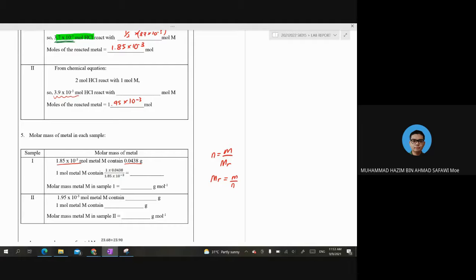23.6756, so 23.68. Okay, does everyone agree? Yes. 2, 3, 6, 8. Okay, 23.68. That is for your sample 1 metal.